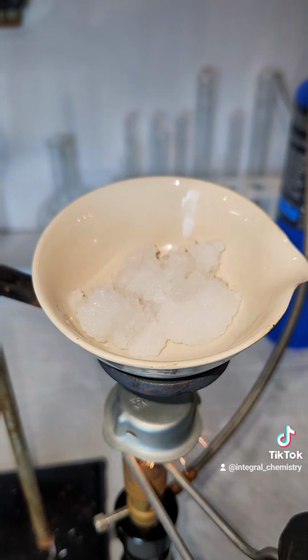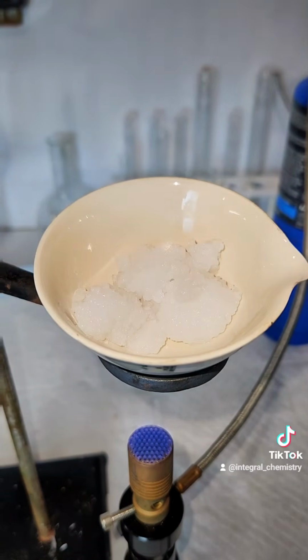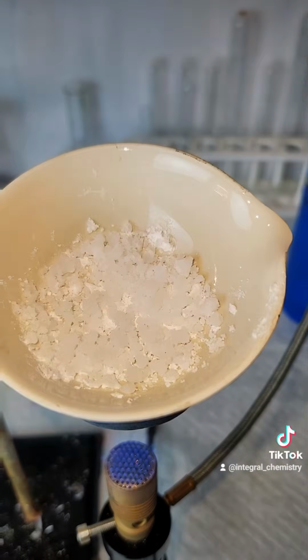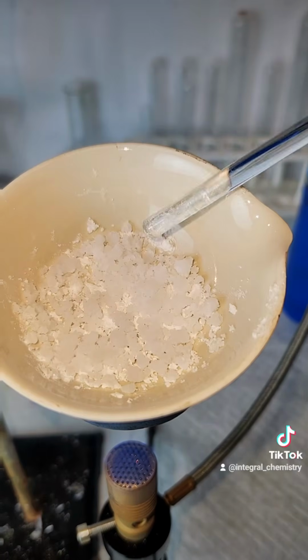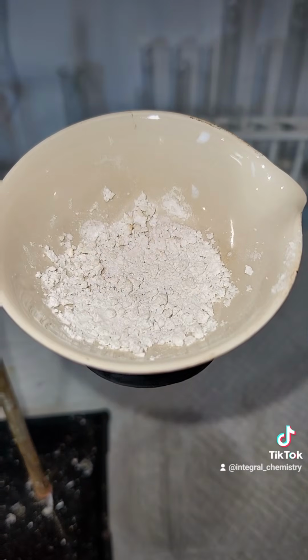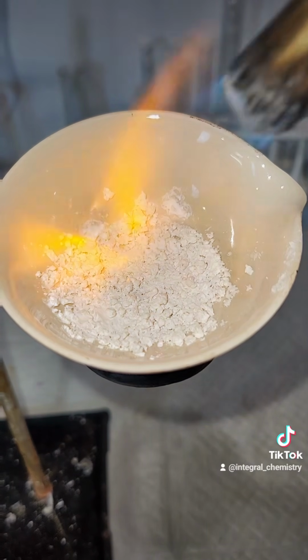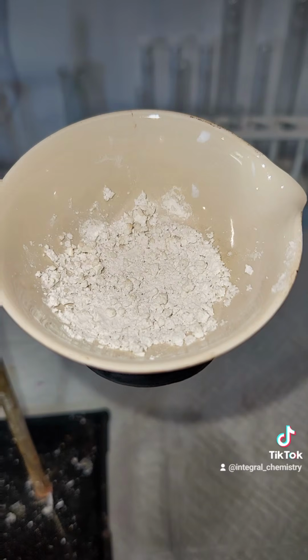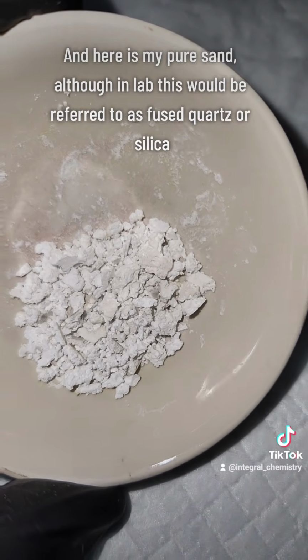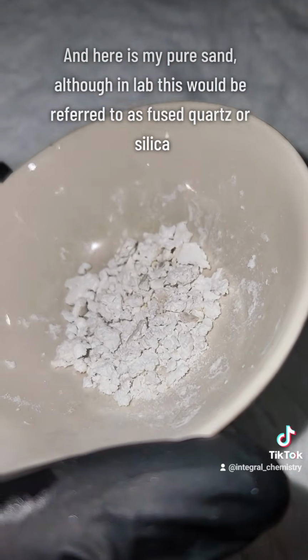This part of the process can also be manipulated to produce other silicate materials such as silica gel, quartz, opal, aerogel, and a couple other things. For sand though, I just keep heating until my final product is pure, white, crystalline silicon dioxide. And this is sand. However, in lab, we would more refer to something like this as being silica or fused quartz, but it's really the same thing.